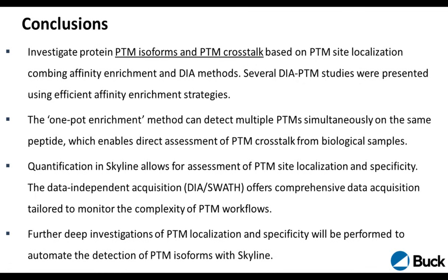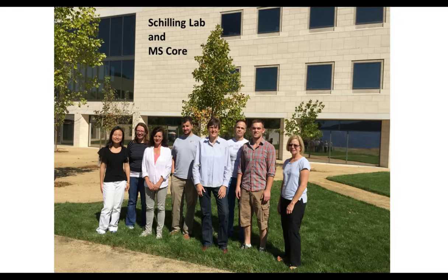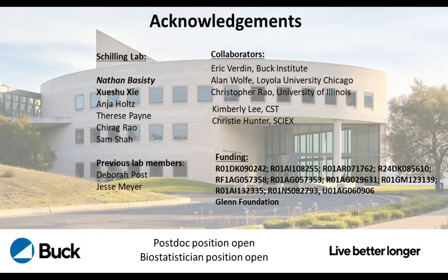So I think what I have shown you today is a big interest that we're having in dynamic aspects of PTM research, and getting as much depth as you can. And the PTMScan antibodies were a great tool for us in all these projects and have allowed us to really find interesting biological events. I'd like to close with showing you my group here at the Buck Institute in California.